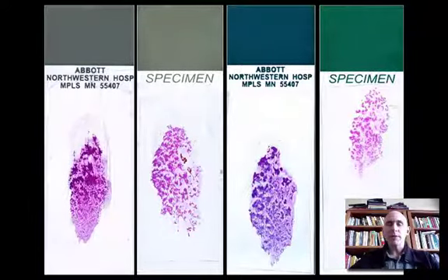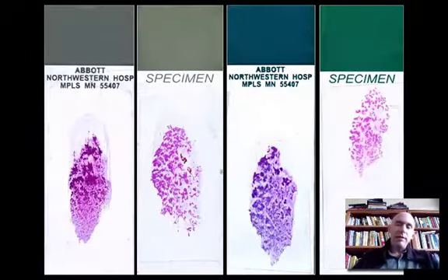Now, these are some examples of some really great smears that were done in our system. You can tell that the particles gave way readily, and they formed a nice oval region within the center of the smears. Even the smear on the far right here forms a beautiful oval, although it flirts with disaster in terms of coming close to this frosted end, it does a very nice job of actually spreading the material out.